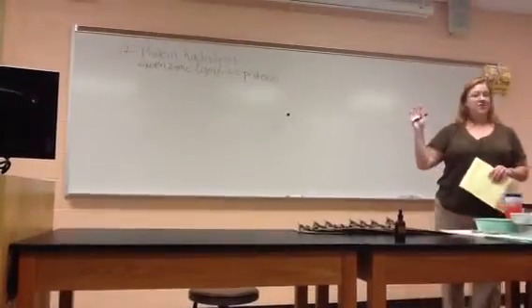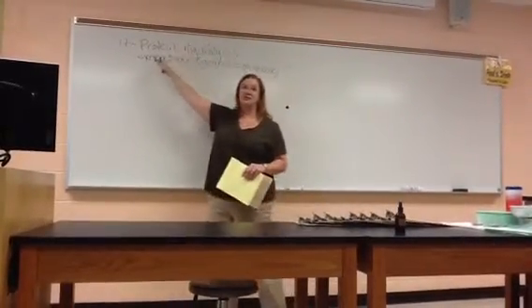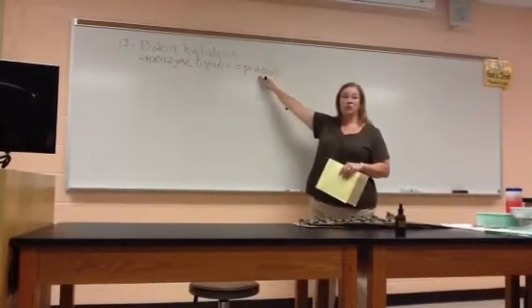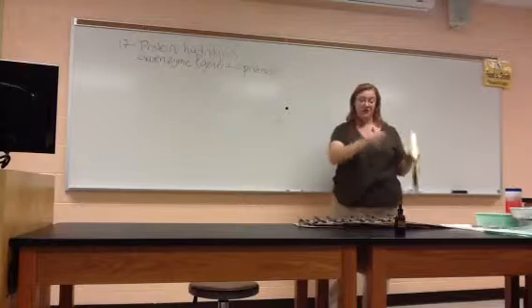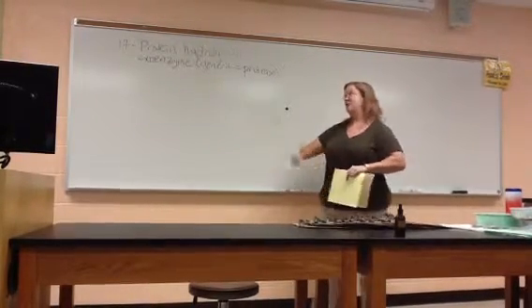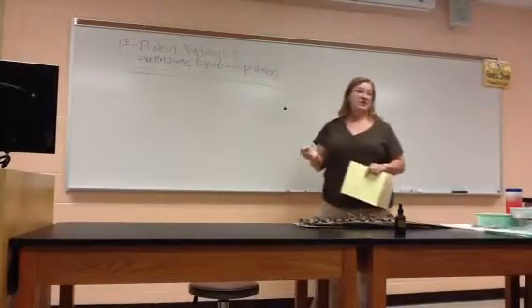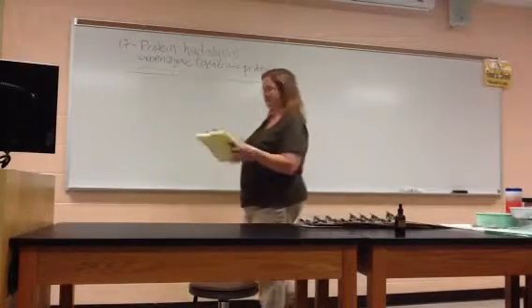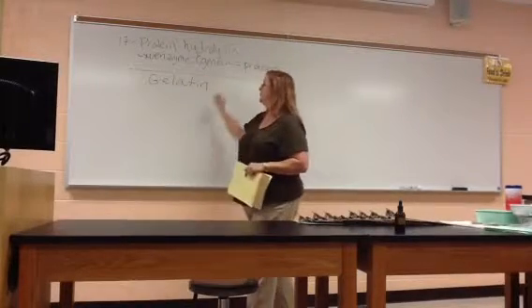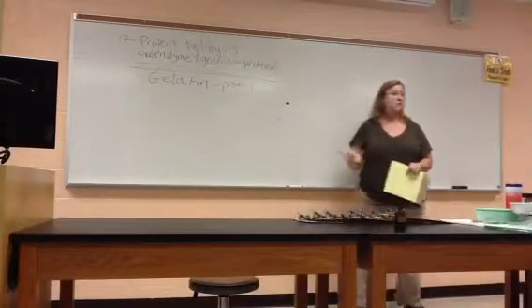Okay, so protease is a very general, very generic term for some molecule that breaks down some protein. But again, just make sure that you know that it's not the magic enzyme that breaks down all protein. Every specific protein has its own specific exoenzyme that breaks it down. Okay? So, generic term there. We're going to be looking at two specific proteins in this lab, gelatin and casein. Start with gelatin. That's our first protein that we're going to give to bacteria and see if they can break it down.